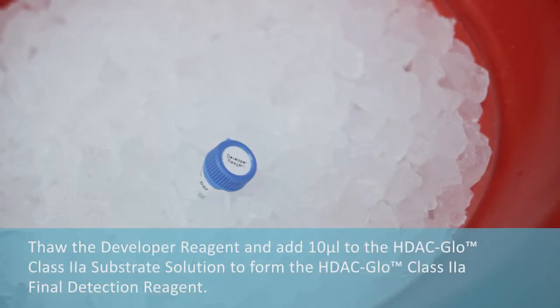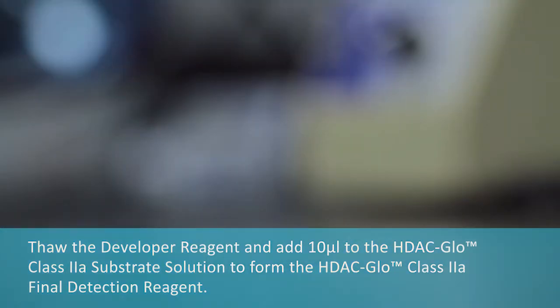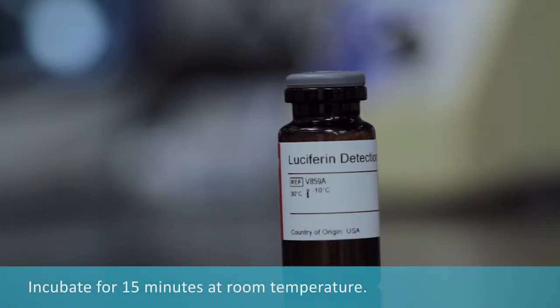Thaw the developer reagent and add it to the HDAC Glow class 2A substrate solution to make the HDAC Glow class 2A final detection reagent. Incubate for 15 minutes at room temperature.